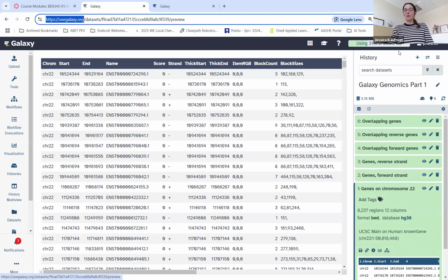In this Galaxy Part 1 history for Galaxy Genomics, you're going to pull data not from your computer, right? So this is a little bit like the side loading that we did in R. We're able to get FASTA files by writing code in R. We're able to get other information for different tutorials last week in R, either in Posit Cloud or on a computer. And now we're going to do something similar. We're just going to launch that code through this website.